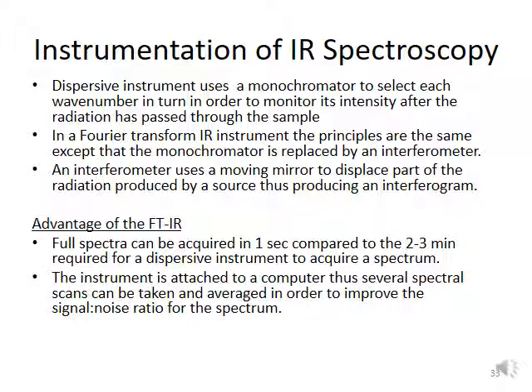You can get the full spectra in 1 second, compared to 2 to 3 minutes for a dispersive instrument. Next, the instrument is attached to the computer. Thus, several spectral scans can be taken and averaged in order to improve the signal to noise ratio for the spectrum.